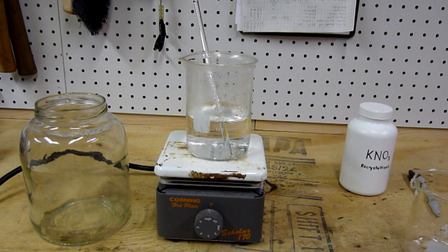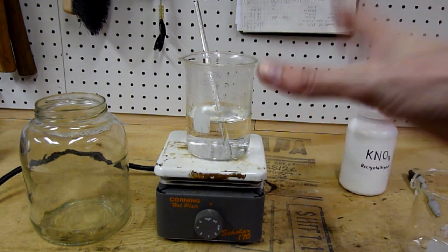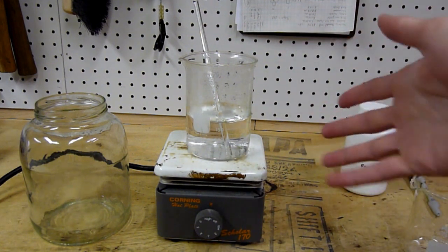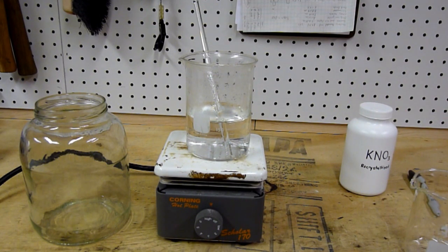Recrystallization is a very easy concept to understand. Basically, when you make a saturated solution of the material you want to purify and then cool down that saturated solution to reduce the solubility of the thing you want to purify, it falls out of the solution in the form of crystals. Because crystals form a lattice of the same type of molecule, they're very exclusive to impurities, and therefore the crystals end up being of much higher purity than the solution.